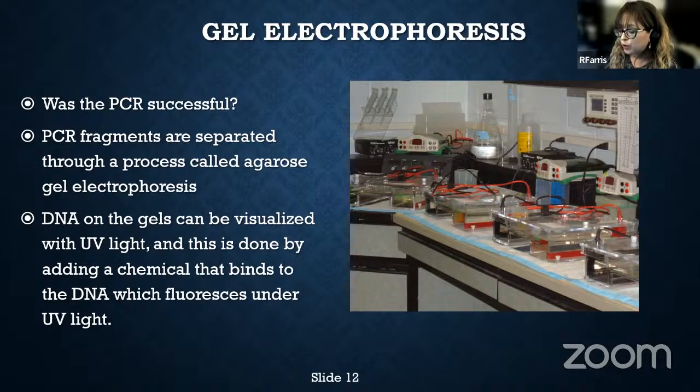The reason it's considered dangerous and a carcinogen is because ethidium bromide attaches to the DNA. It's called intercalating into the DNA. So it binds into the DNA, but the reason we do that is because ethidium bromide glows under UV light. And so the idea is we want to have a way to visualize what we're seeing on the gel, and that is what we do.